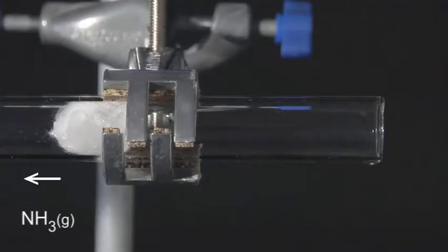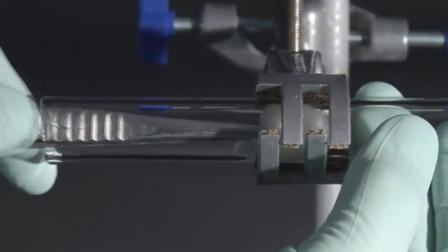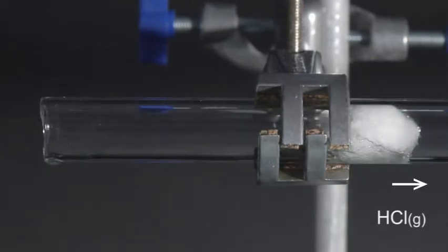The large surface area of the cotton wool allows ammonia and hydrogen chloride vapors to escape into the tube.